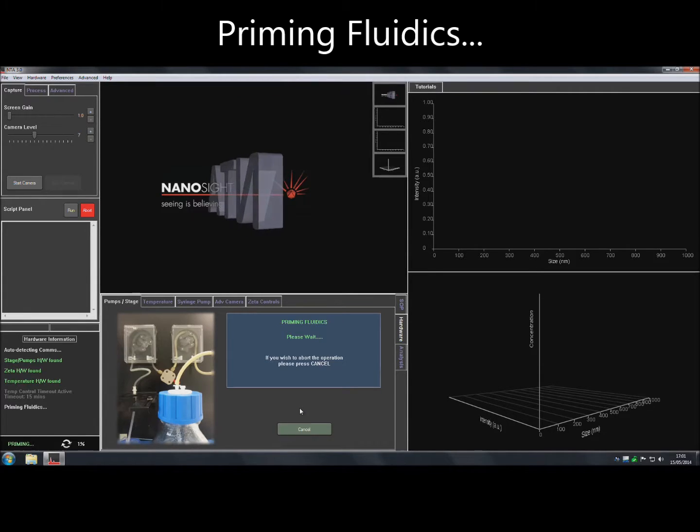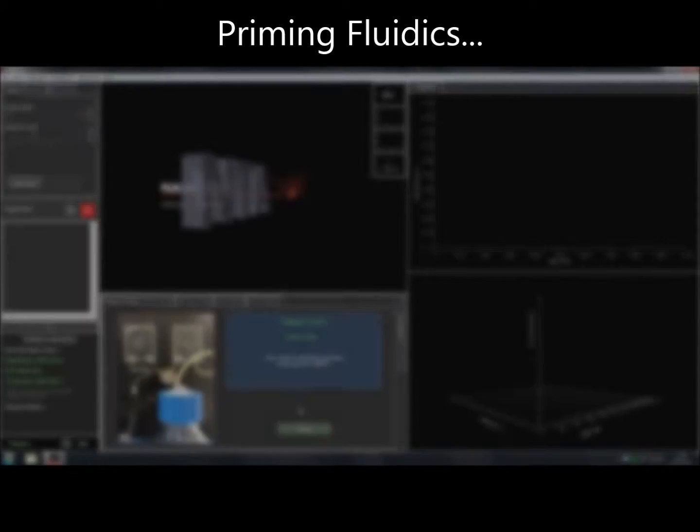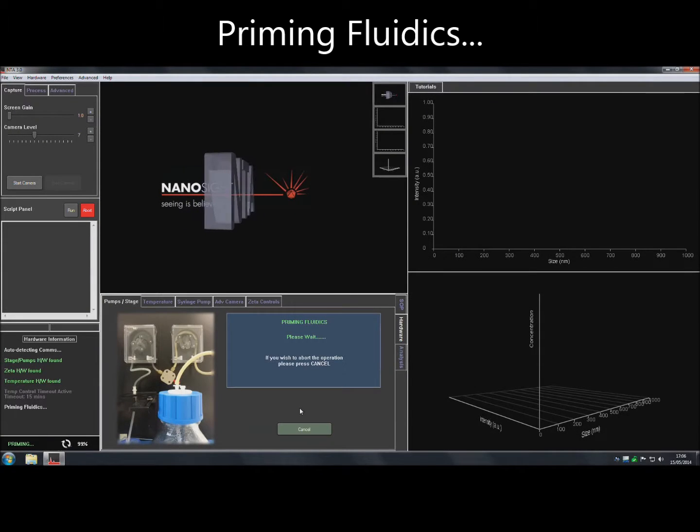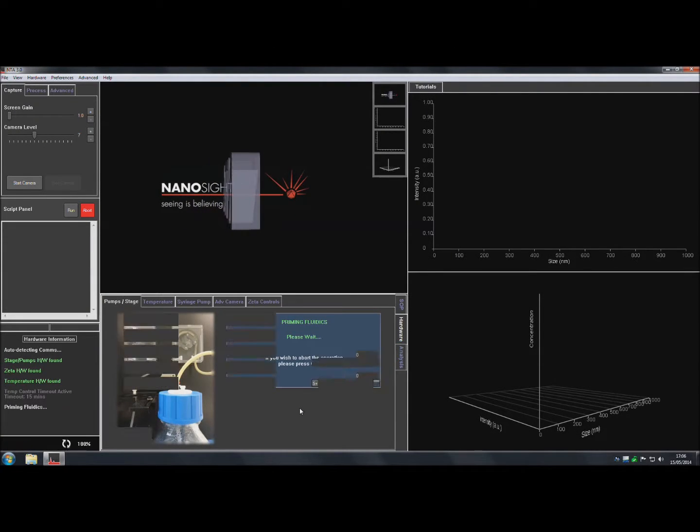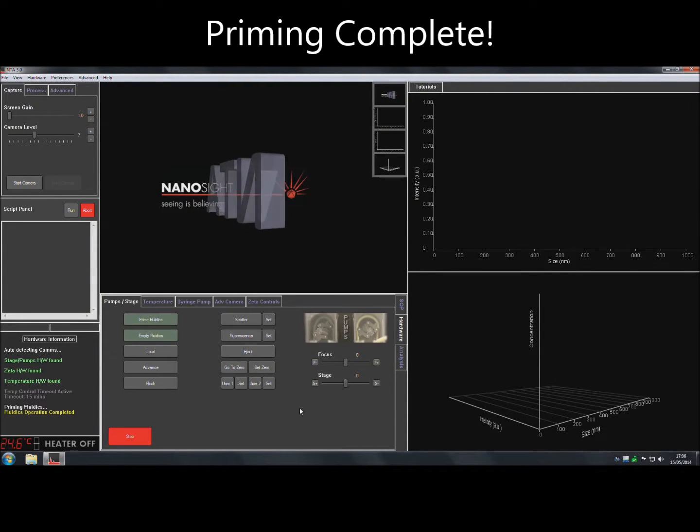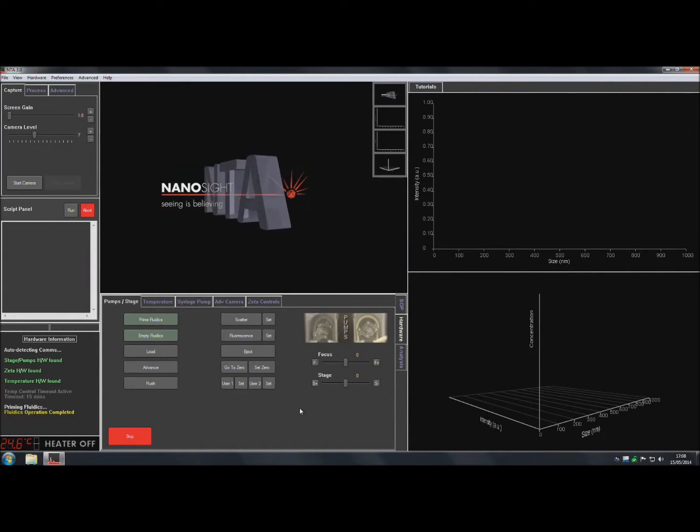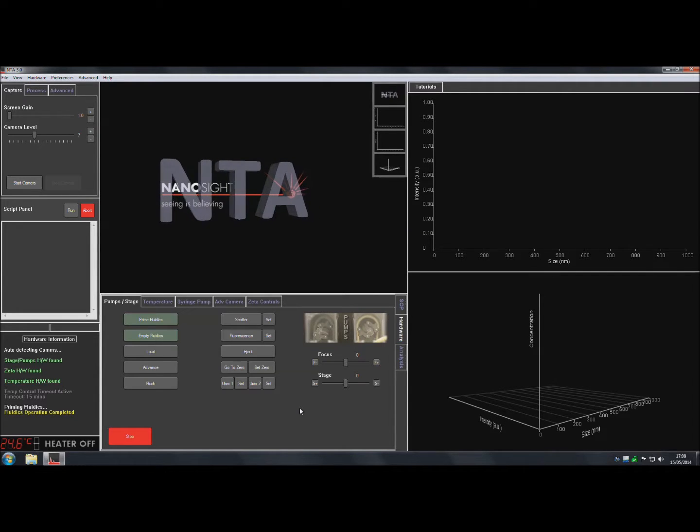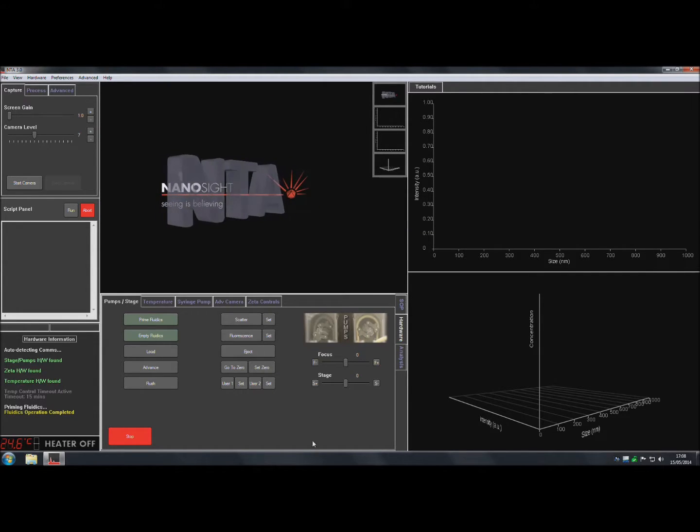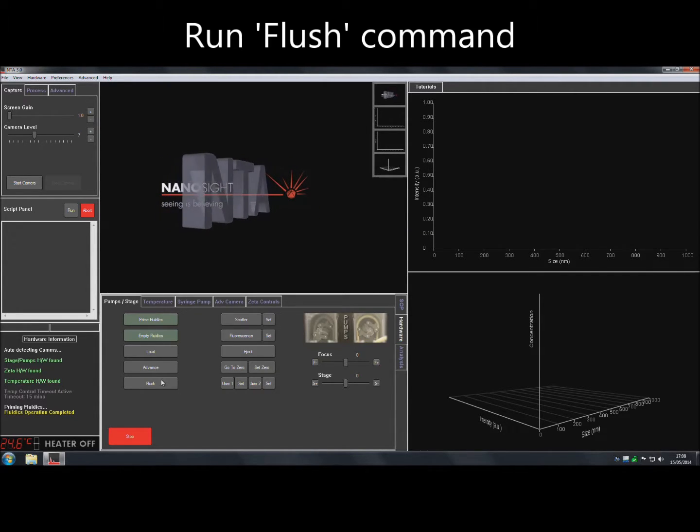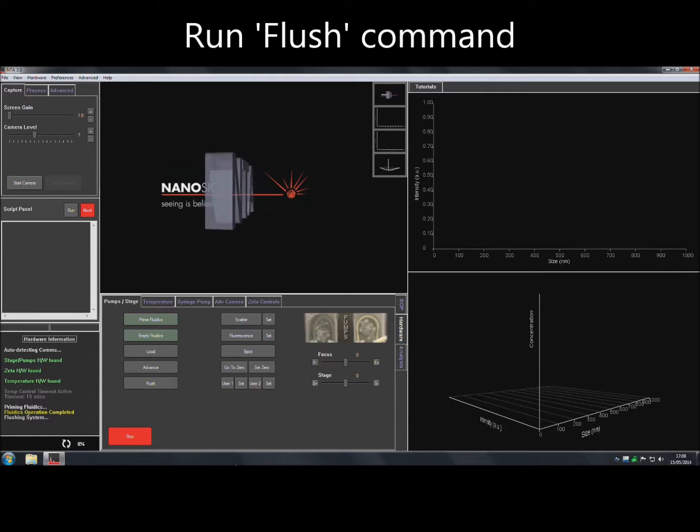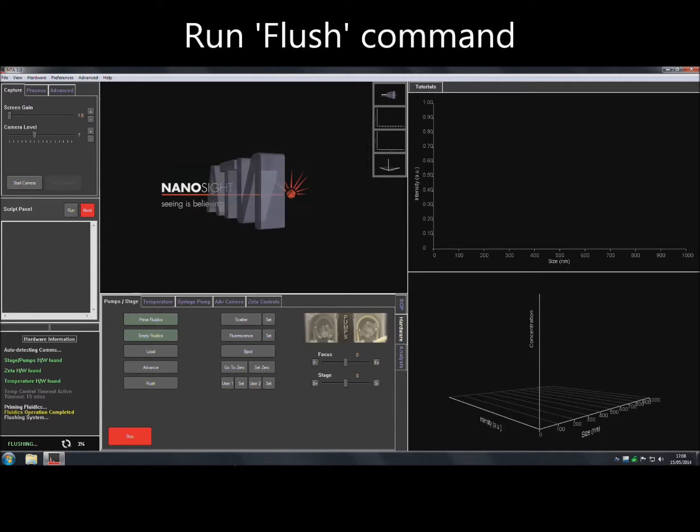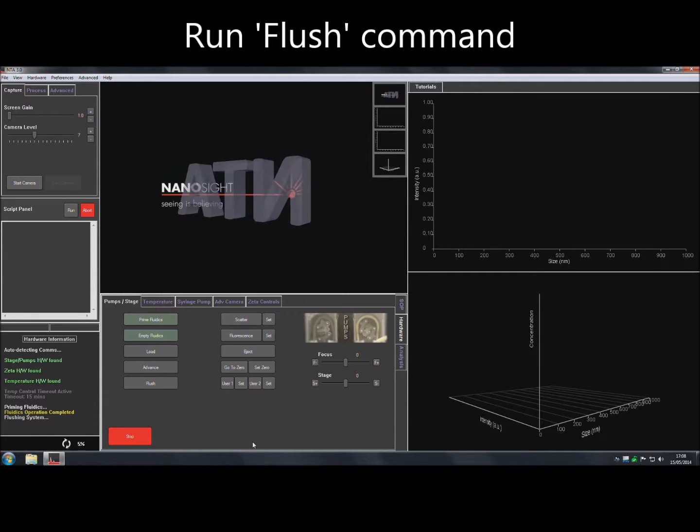Once the fluidics have been primed, faster pump sequences such as flush and load can be used without causing damage to the delicate gasket. Once the Prime Fluidics operation has finished, click on Flush to ensure that all tubing is filled and that no leaking occurs around the gasket and top plate on the laser module.